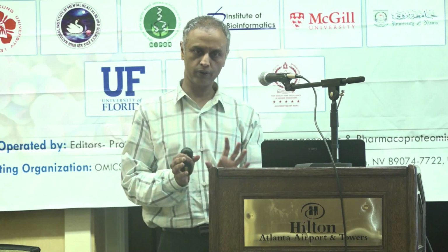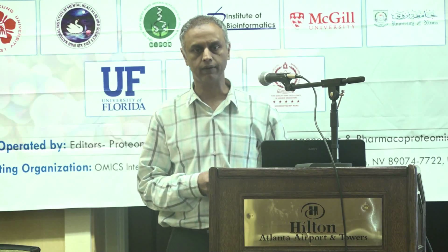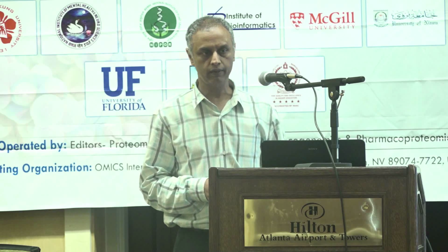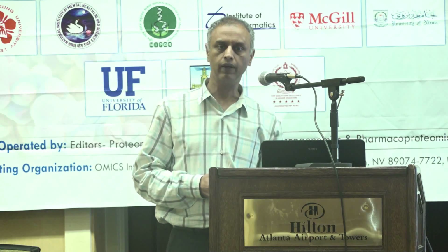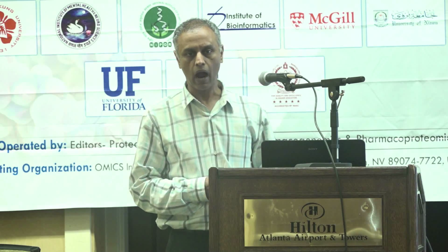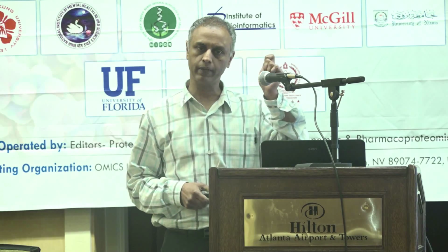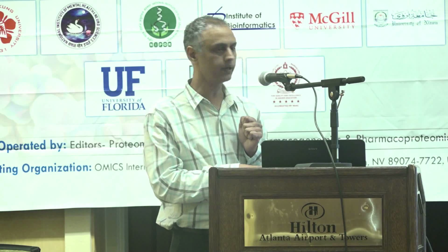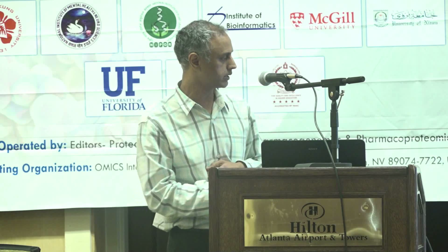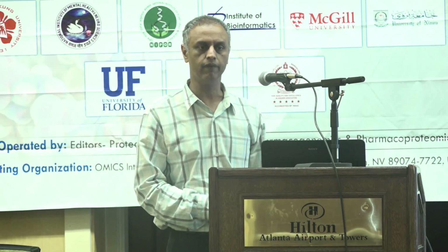And in order to see how we can do this in a clinical time frame, this is the one thing that is highlighted by manufacturers of these MALDI-TOF platforms: you need to get answers really fast. And many of these LC-MS type regimes take hours. So what we did was, we will digest the material for 1 minute, and we'll run it for 1 minute. We'll digest it for 5 minutes, and we'll run it for 5 minutes. And in all of those, we can uniquely identify the organisms very easily.